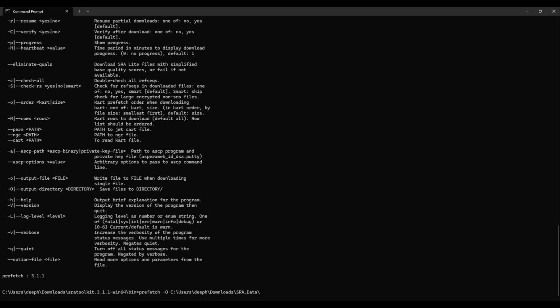And here I want to give another folder, for example, SRA new.